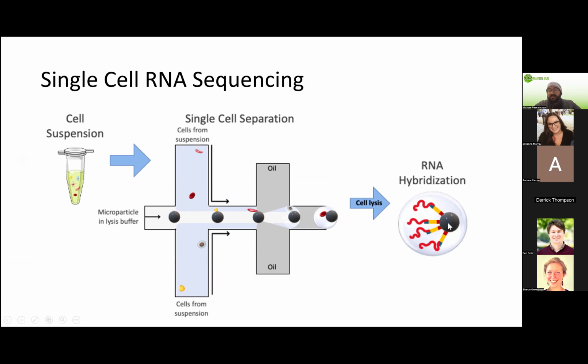Typically then, the cell will be lysed chemically, and then the RNA inside of it will be tagged by probes on top that are attached to the bead, and eventually then turned into a library and sequenced. So that lets us get a map of RNA data along with the cell that mRNA was from.